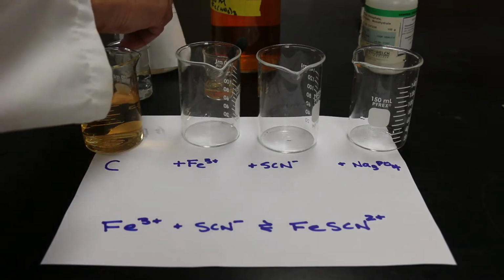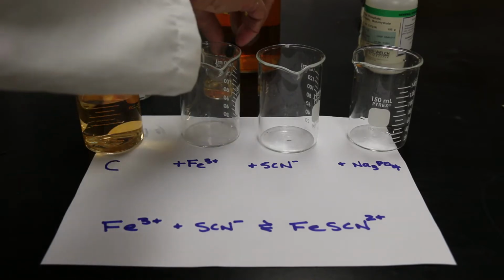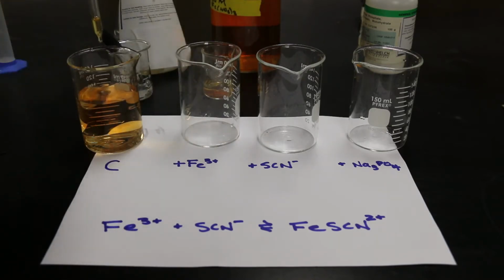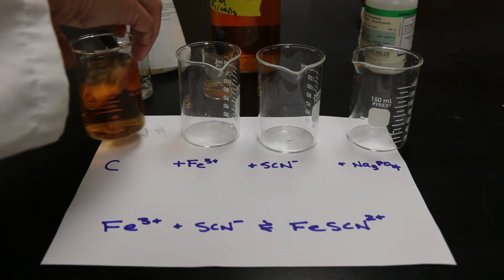But just to make it a bit darker, I'm going to add a bit more. Make it a little bit redder so we can see that color.